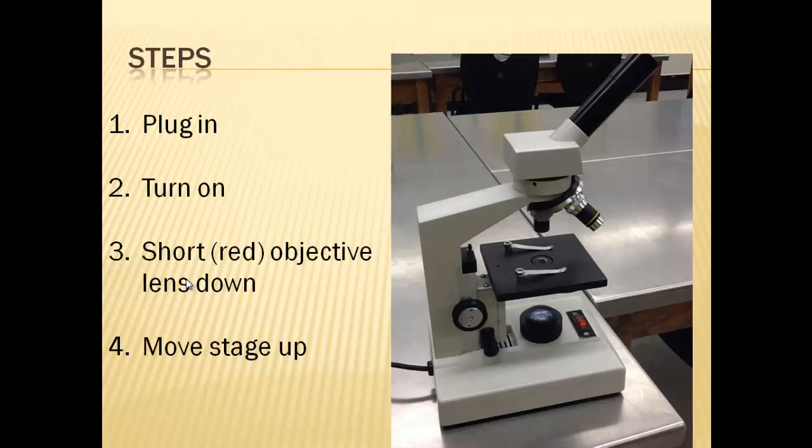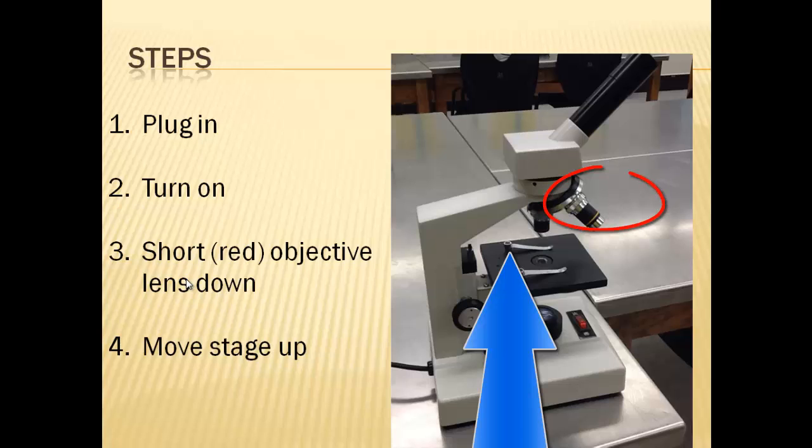Once you plug it in and turn it on, you want to make sure that you have the short red objective lens pointing down. That's right there. The reason why you want to do that is because oftentimes the next step where you're supposed to move the stage up, if you have one of the others pointing down, the stage will actually go past the point of where those objective lenses are coming down, and you can actually break or shatter one of those other objective lenses. So we really want to make sure we're just having the red one pointing down. Those are the first four steps.